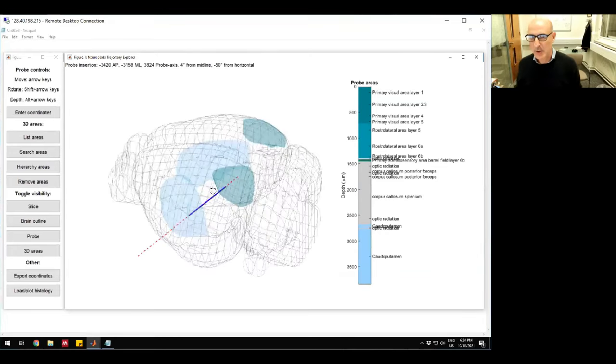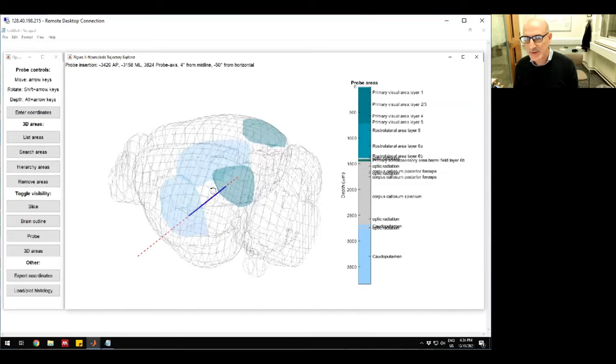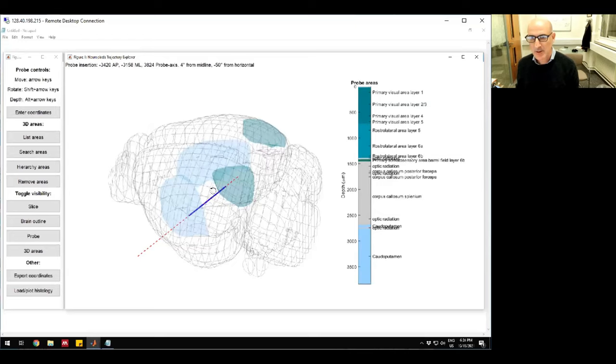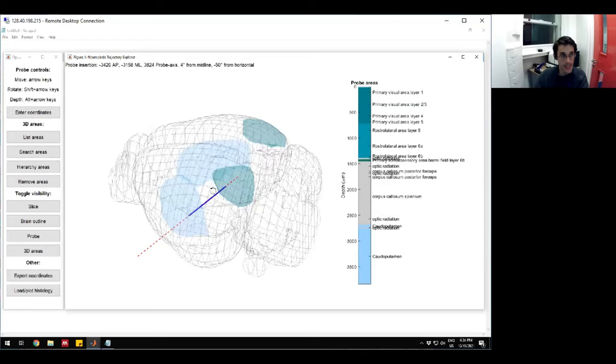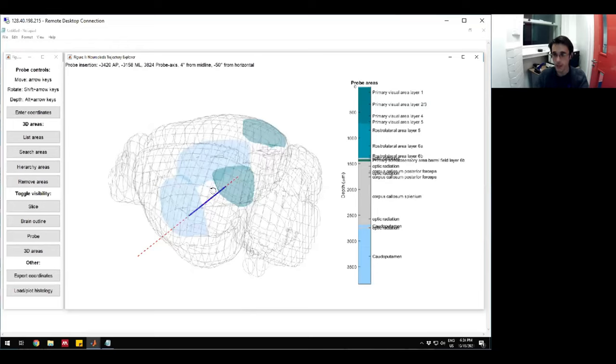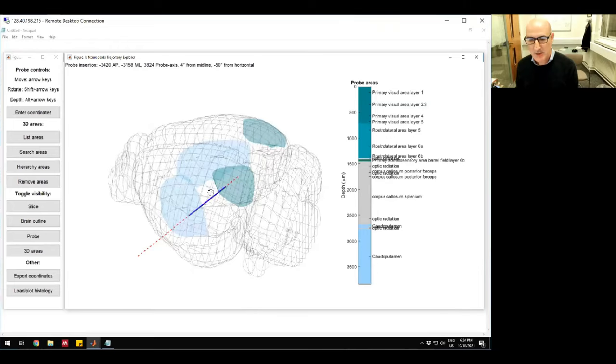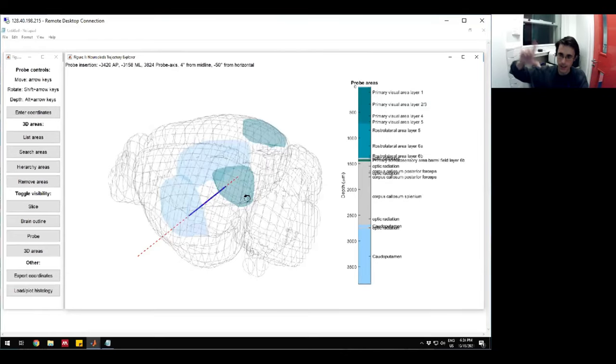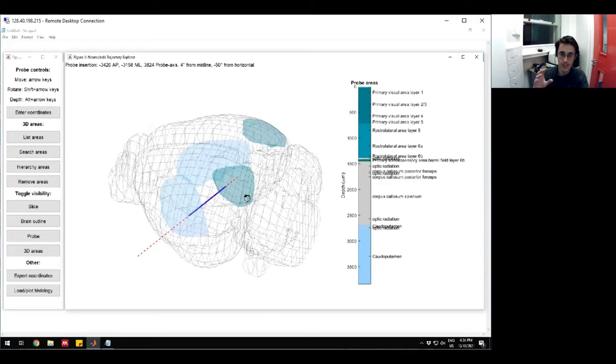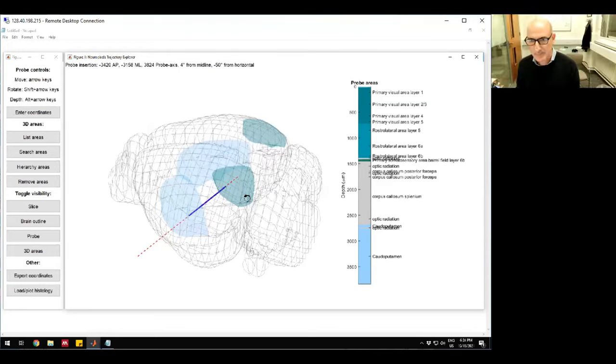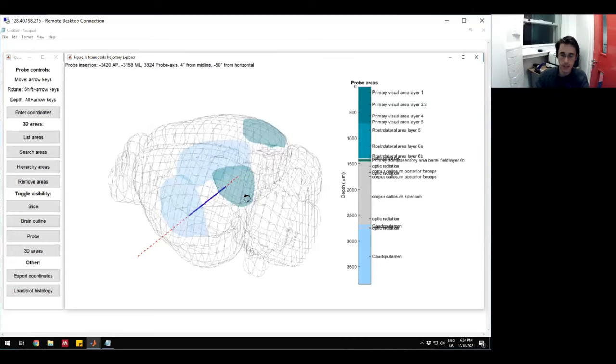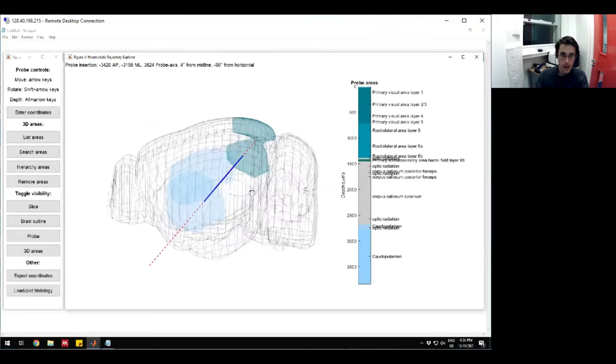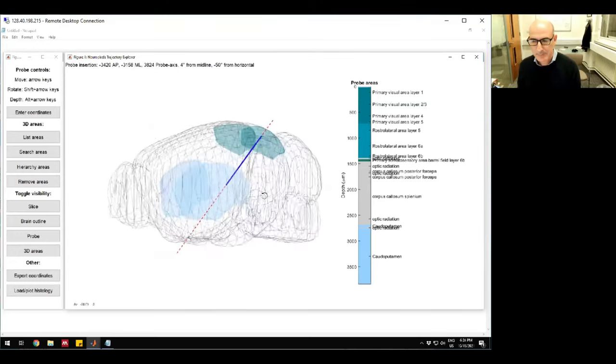Are you descending the probe or are you selecting the sites that will be recorded from in the probe? I'm descending the probe. I don't know if you can do that on the fly, selecting the sites, but I guess it's equivalent if that's a thing you can do. Because you can choose different banks, right? Yeah, that's right. I think you can do that in chunks of 384 channels. In that case, if you had it on one, this moves by micron rather than chunk.